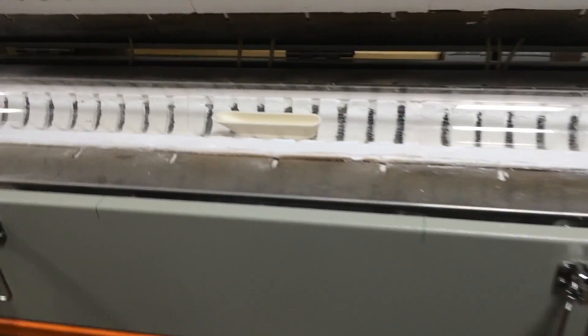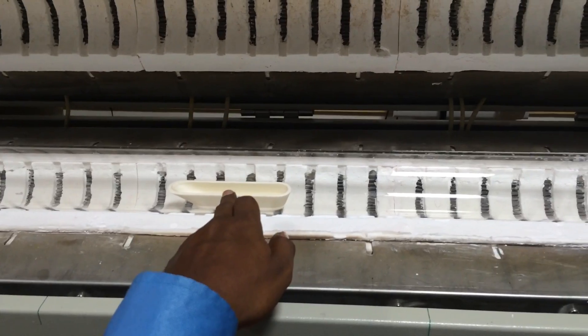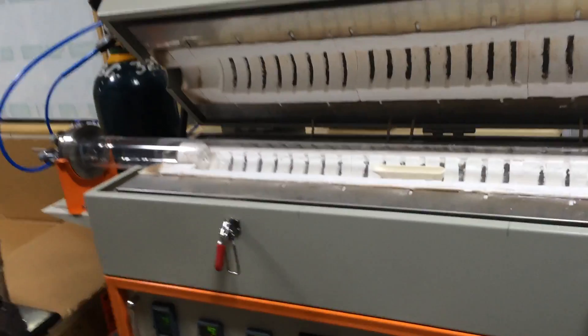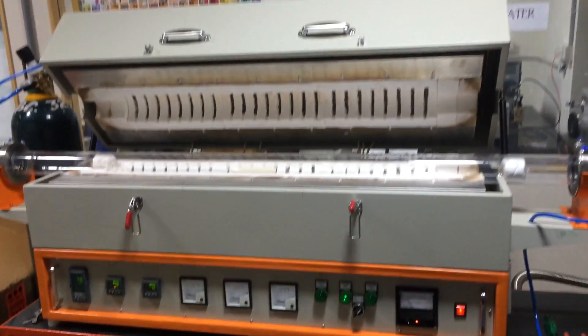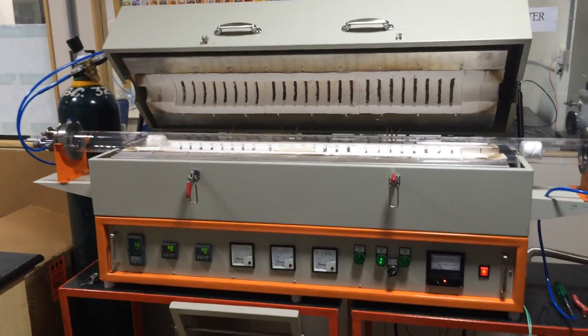We have already calibrated it. So whatever the hot zone temperature is, it is the same as the heating element temperature. This is a three-zone split tube furnace from Ant Ceramics Private Limited. Thank you.